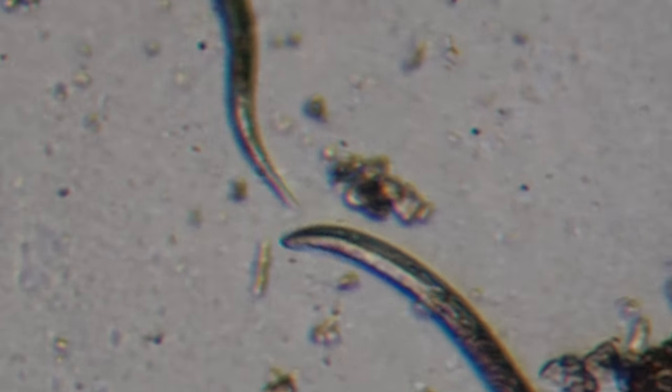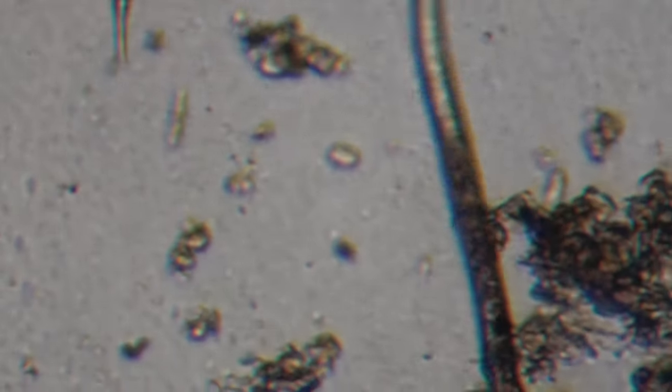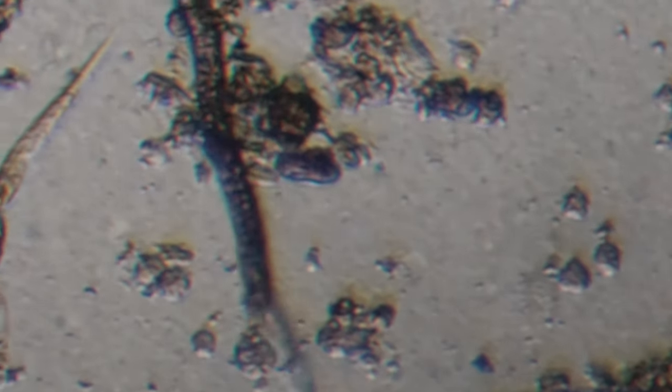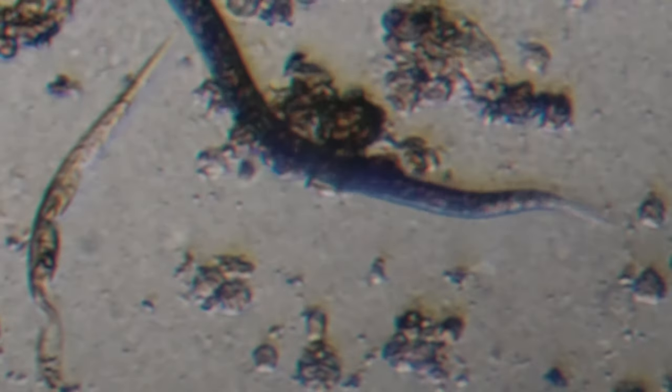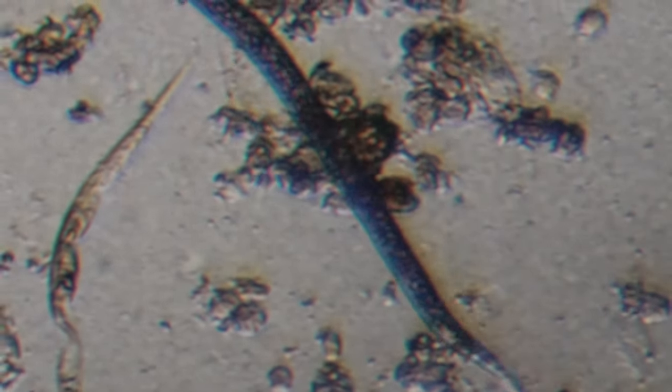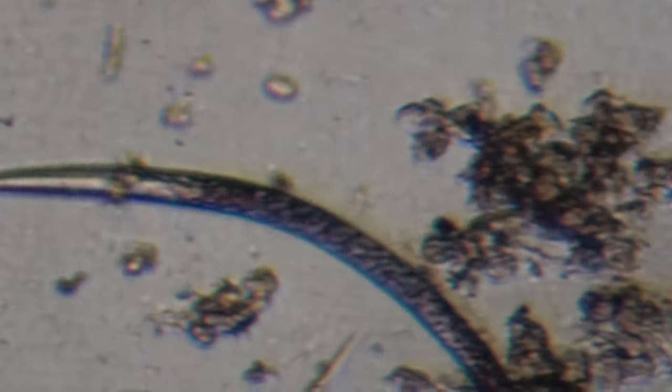So I decided to take out the microscope and see if anything's actually alive, or if it's just a bunch of snake oil. So there you go — I guess there are things that are alive. I can't really identify them; I don't know if that's what they are or if that's what they should look like, but there is definitely something alive in there.